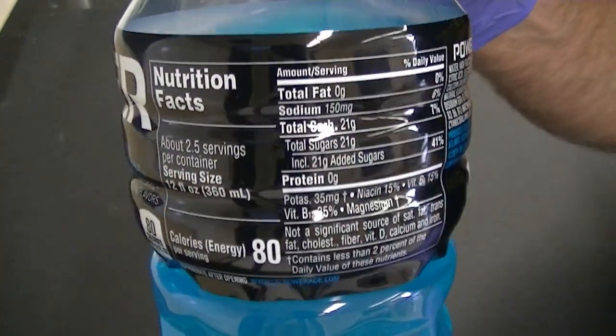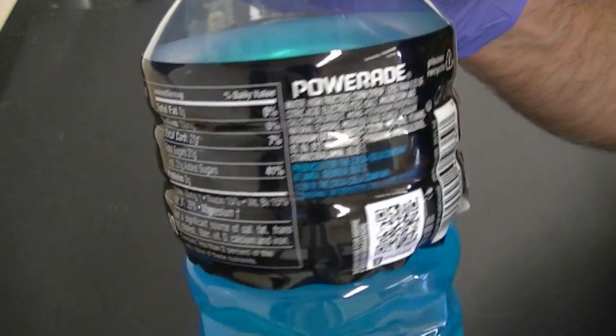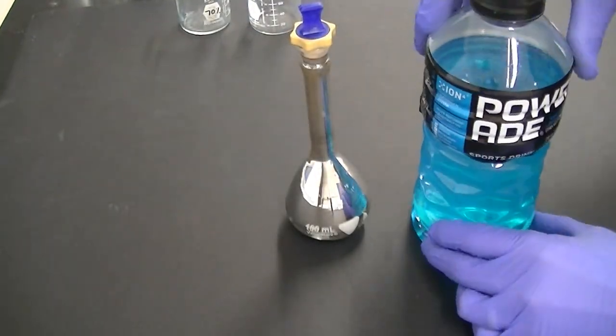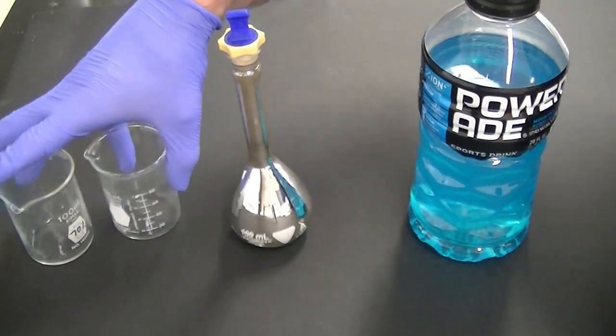Sports drinks like Powerade contain high fructose corn syrup, which is made mostly of fructose and glucose. This made me wonder if these sugars in Powerade could react with silver ions to form a silver mirror.